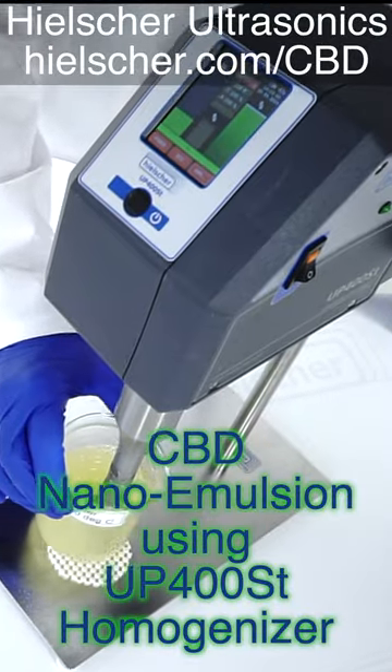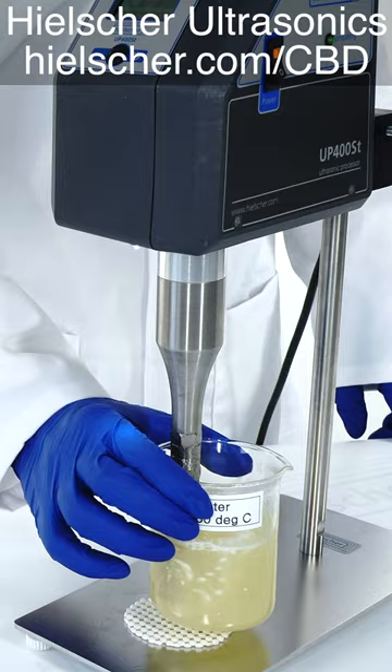In this video, we make a nano-emulsion of CBD-rich hemp oil in water using a Heelscher UP400ST ultrasonicator.